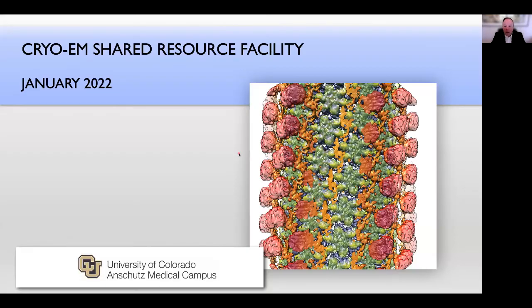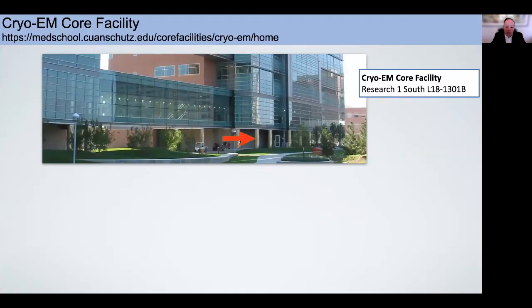So the CryoEM core facility is one of the newest facilities on campus. We are located on the first level of the RC1 South building. Access to the facility is through a badge permission. So usually we meet new users in the lobby of the RC1 South building.